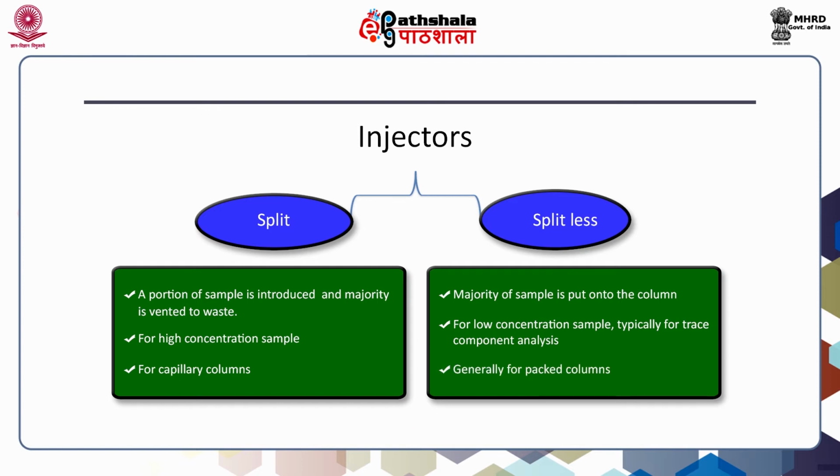Generally these splitless injectors are used with packed columns, or wider columns. These injectors are very important because they affect the efficiency of our gas liquid chromatography analysis.